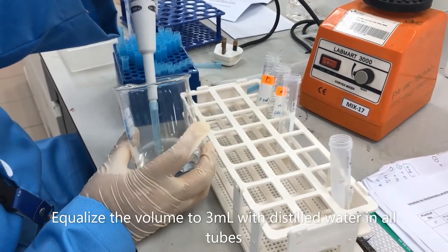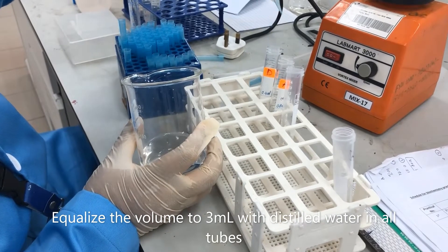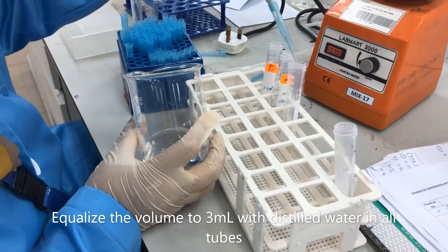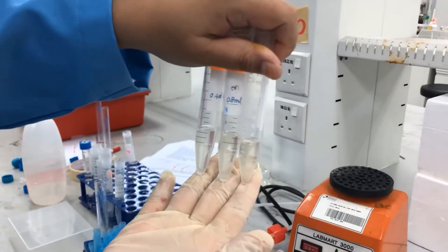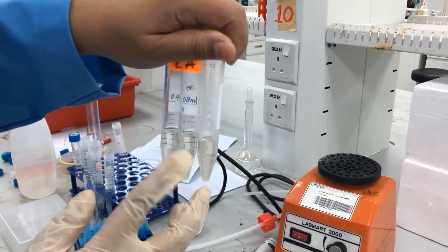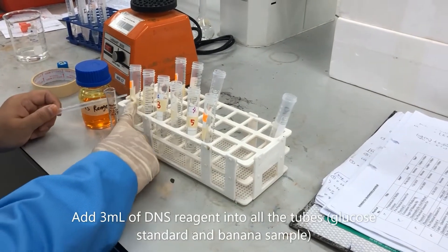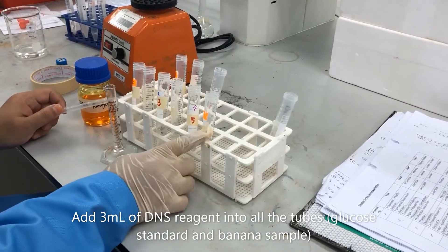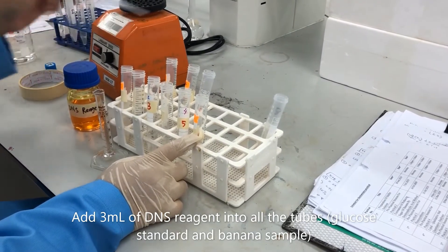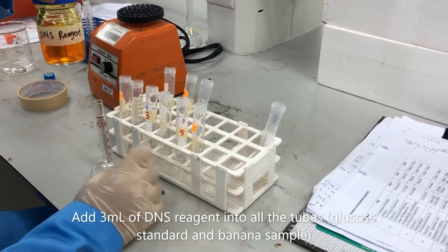Here we add distilled water to equalize to 3ml total. We have all total of 3ml — extract with distilled water. We will add on 3ml of the DNS agent. Here we have glucose standard tubes 1 to 6 and 3 extract tubes of banana. We add 3ml DNS agent for each tube.